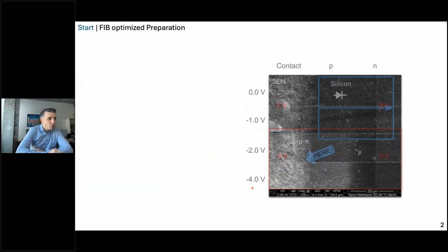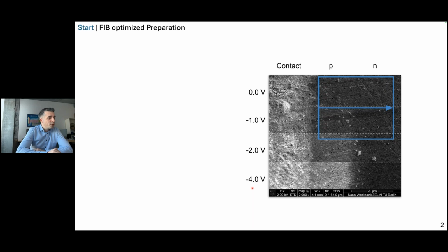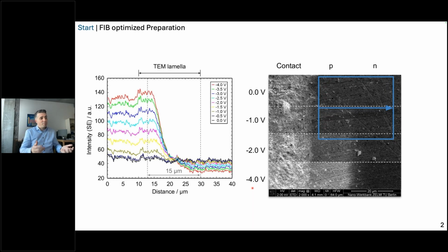I actually tried to turn this into a very simple biasing experiment by trying out how the contrast changes over the applied bias. If you look at how the contrast changes with the applied bias, you can clearly see that something is happening if you apply a reverse bias to the diode. So the diode's still doing diode things, which is always good. For us, it was clear that somewhere in this region we can get out our material for the TEM lamella. But keep in mind, the TEM lamella will be very big. So this is not a semiconductor nanostructure, but a semiconductor device anyhow, and we wanted to start.